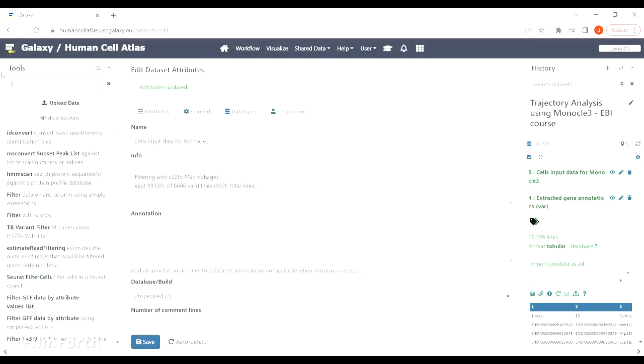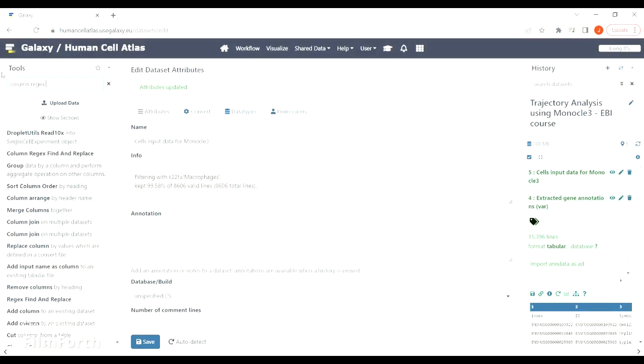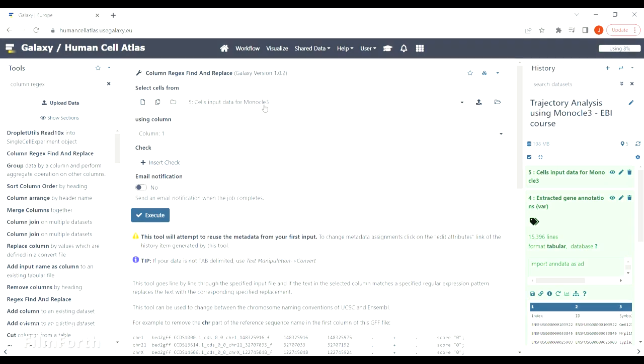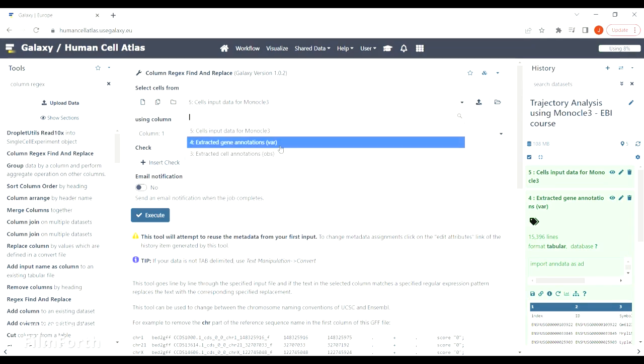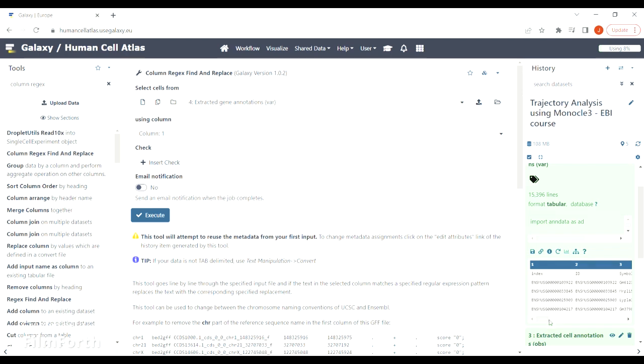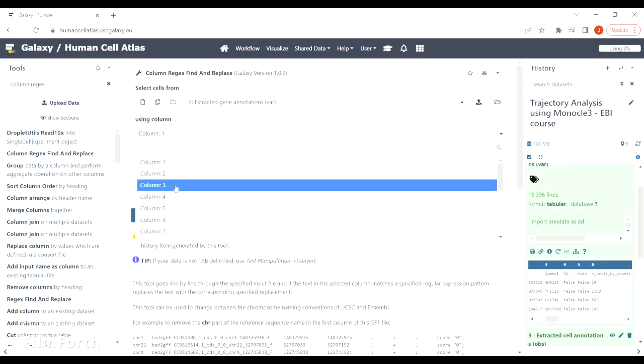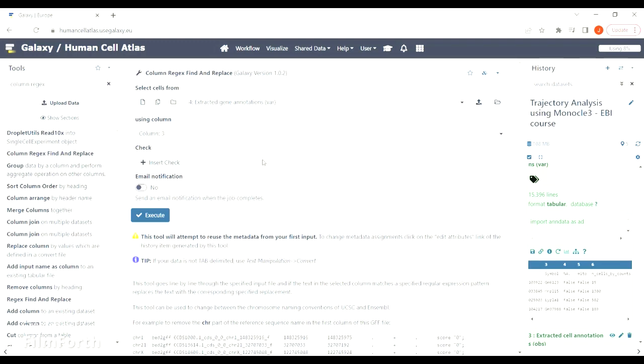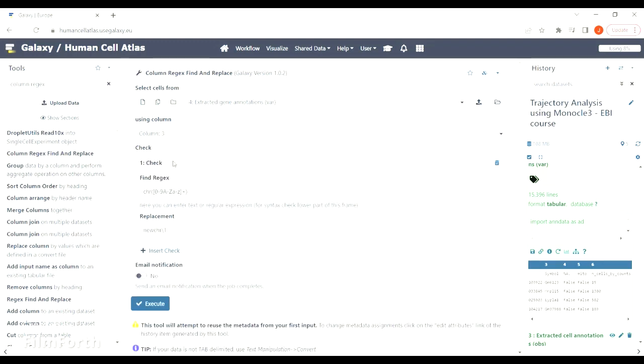Find the tool. Now we are going to replace the title of one of the columns which stores gene names, because Monocle would need to use the title called gene short name instead of symbol. We can check that it's column number three and simply replace that title.